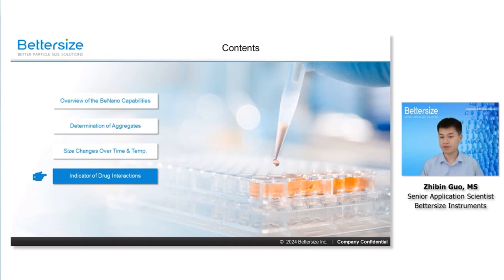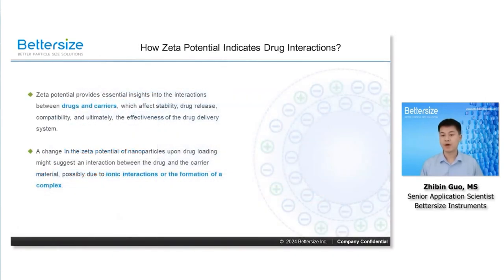In the final part of this talk, let's shift our focus to zeta potential and explore how it can serve as an indicator of drug interactions. Zeta potential is commonly used to study the isoelectric point, IEP, and surface adsorption of particles in liquid media, serving as an indicator for comparing the electrostatic dispersion stability of different samples. It's not an inherent property of suspended particles. It depends on the properties of the particles and the medium, as well as their interactions at the interface.